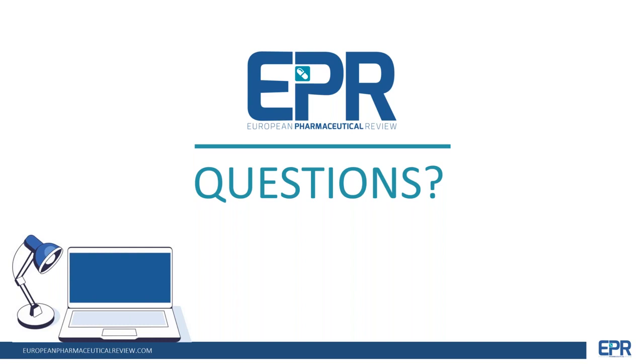Excellent, thank you. Okay, another question. Somebody asks, does the peak width allow MS analysis? And if so, how many MS runs for each run? The short answer is, yeah. Yes, the peak widths that we generate are 3 to 4 seconds wide for this analysis. So it's fast, but it's not so fast that MS can't be done. Obviously, it depends on the specifics of the instrument, but there's nothing about this that is too fast for that.